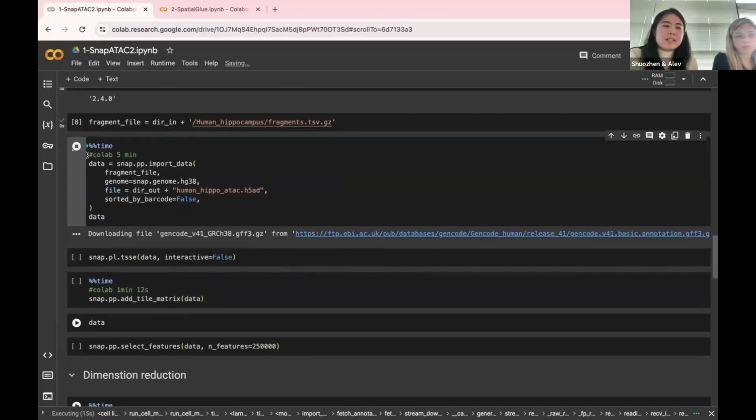So this process roughly takes 5 minutes. If you have questions, you can put them into the Q&A session and let us know.